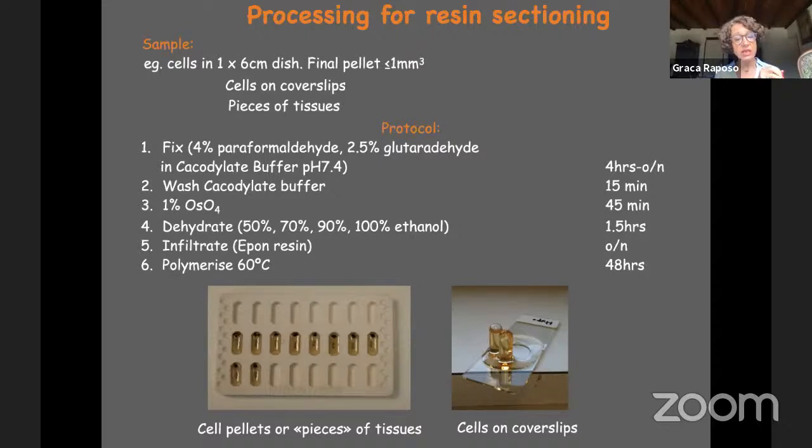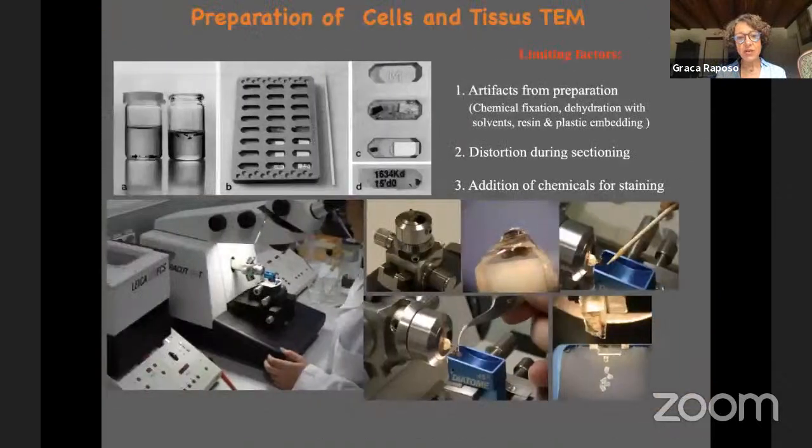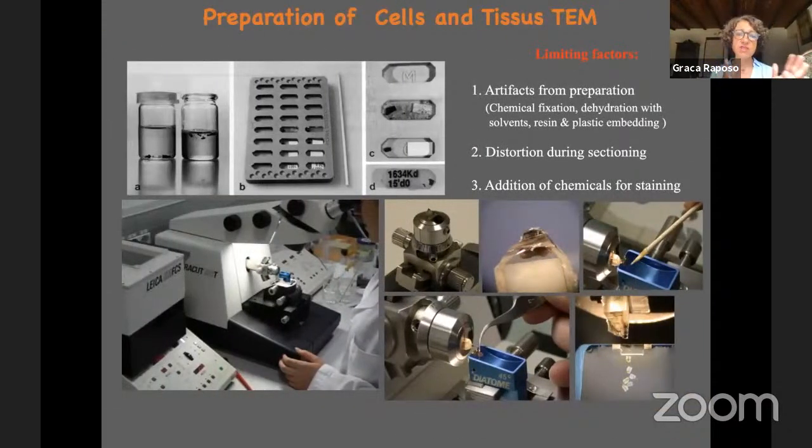Then, as I told you in the beginning, in the principles, they need to be dehydrated. We need to remove the water, and generally we use increasing concentrations of ethanol before they are infiltrated in resins. There are different types of resins, epon. There are also mixtures of epon and araldite. And then we polymerize at 60 degrees for over 48 hours. Generally, you arrange to do it over the weekend. So this takes about 2 days, including the weekends, to give you an idea of how long it is. It's not so long, finally.